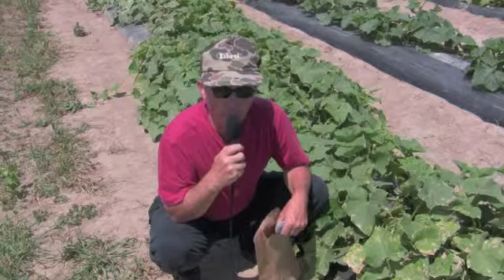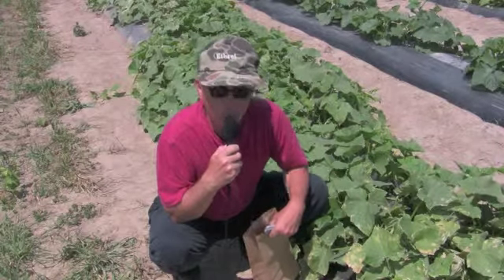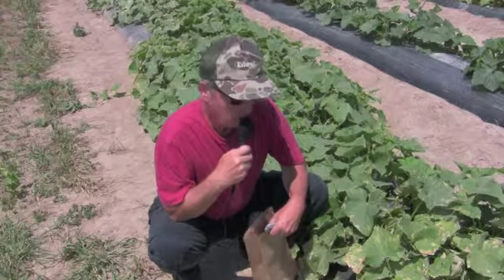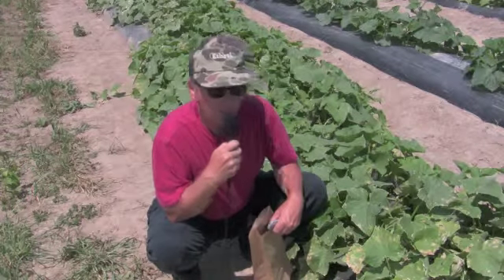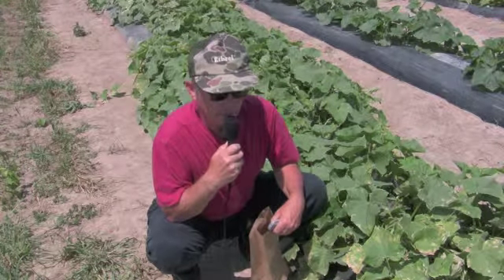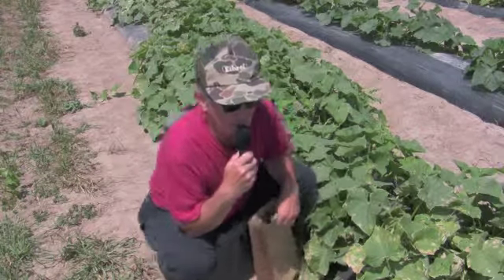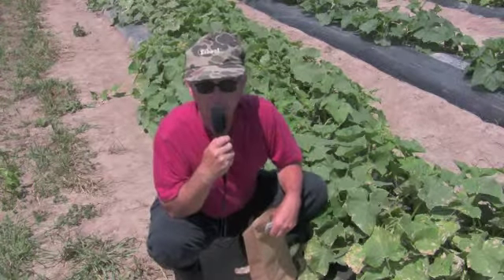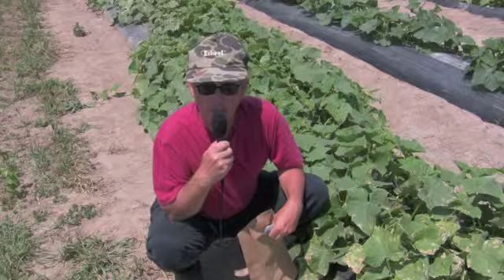So what we want to do is take representative leaf samples of the problem. We don't want really dead leaves. We don't want leaves that aren't showing any symptoms whatsoever. What we want are leaves that are a mixture of the problem somewhat severe and where we can see the problem starting to develop. In this case, we're not going to take the whole plant because the plants aren't wilting down and we don't need to really look at the root system. So today, for this problem, we're just going to take leaf samples.